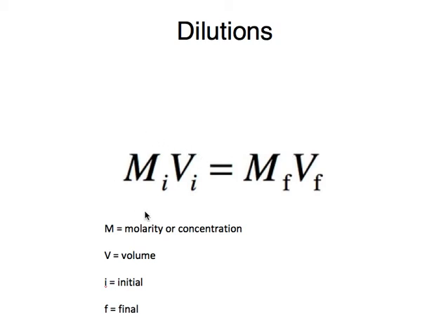And the concentration that you're given would be something that you either made or something that you were given. The concentration that you're aiming for is the concentration of your solution or of your compound that you want the flies to eat. So go through these examples again and again and make sure you understand it, because this equation is probably the most common equation you'll see in a molecular biology lab.